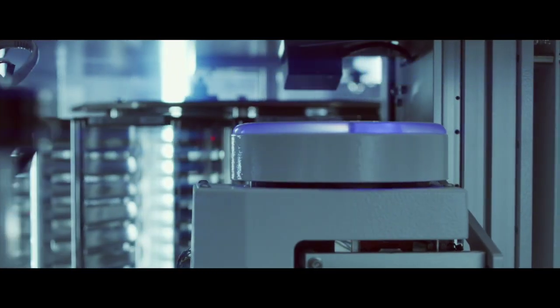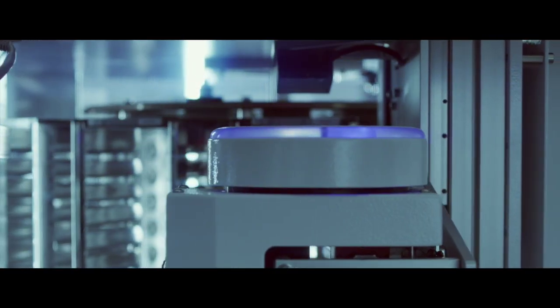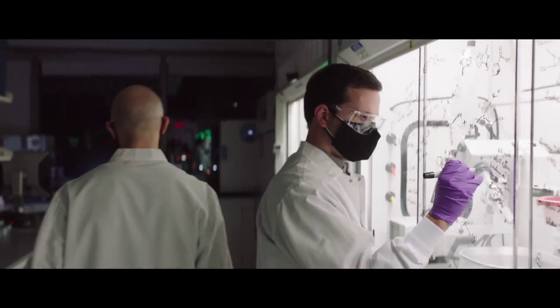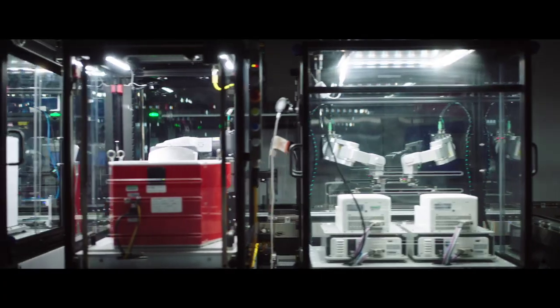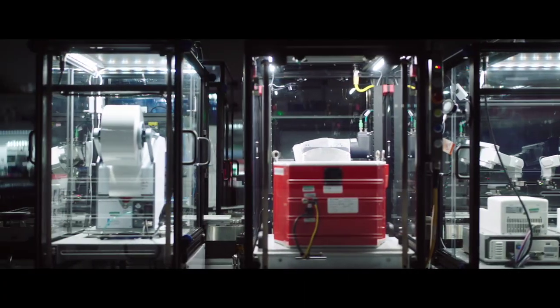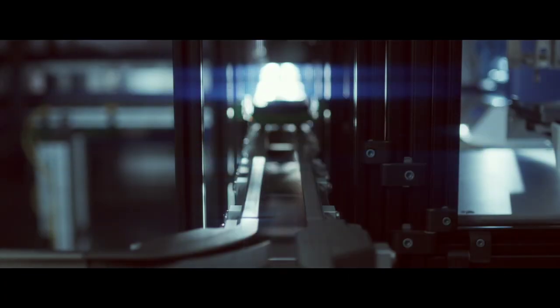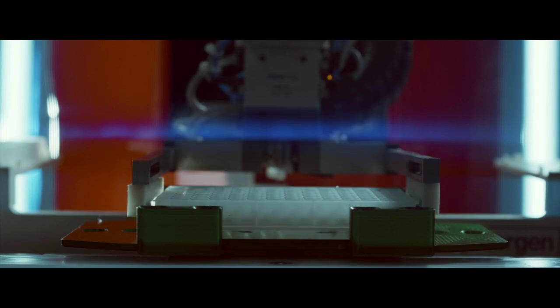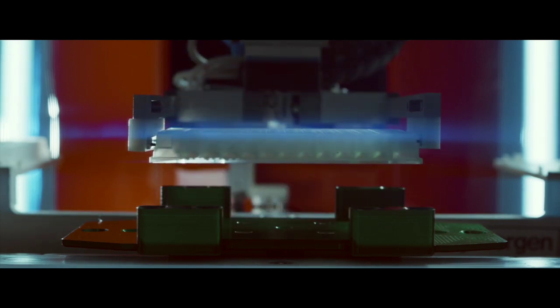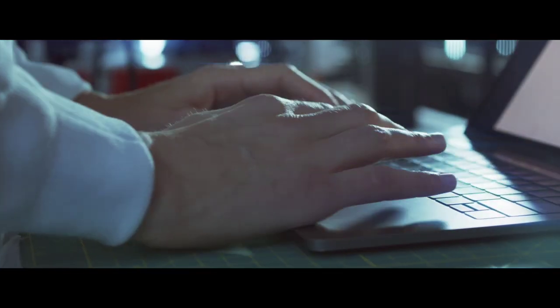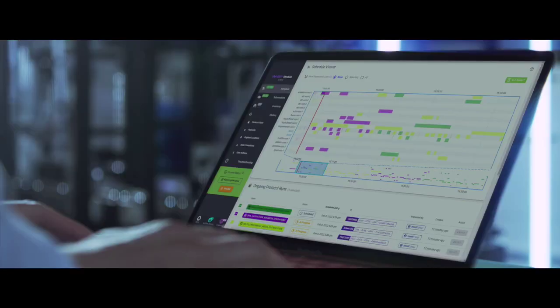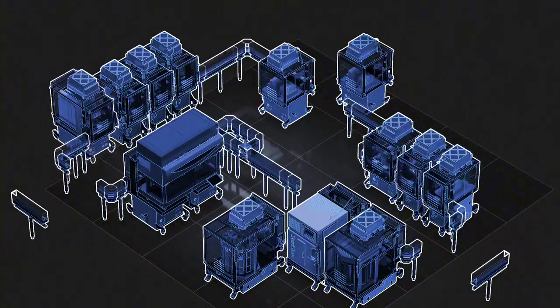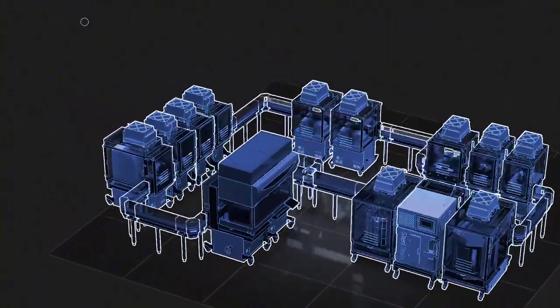Because labs change and ideas grow, we developed a one-of-a-kind lab automation architecture with reconfigurable industrial hardware and modern cloud-based software to enable endless applications.